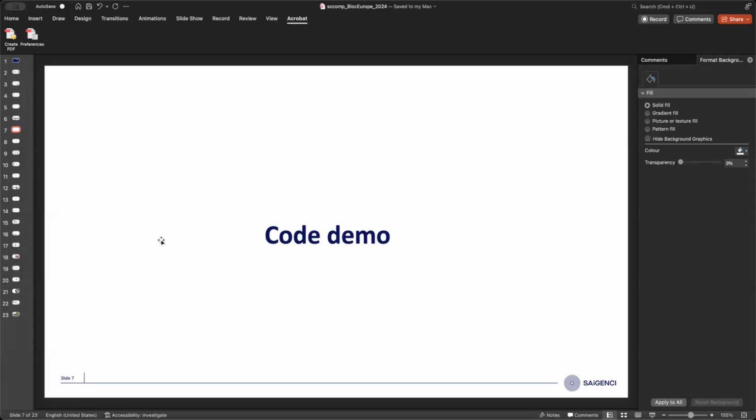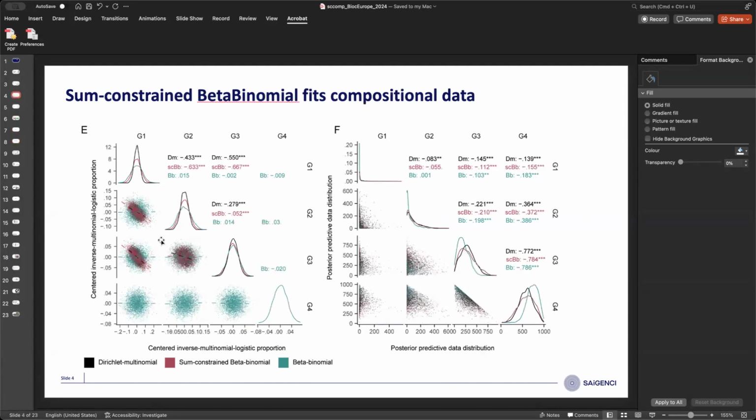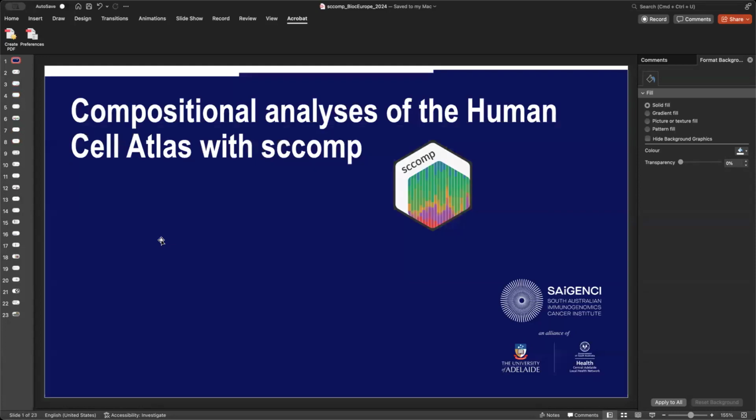I would like to ask about the cell annotation. Is sccomp specifically defined for certain species, or how does the annotation work? No, it's agnostic to annotation. Basically, you have clusters, and you are measuring how their abundance varies in some conditions. In the output you have already annotated some certain cell types. Yes, because when you give sccomp the column of your clusters, that could have arbitrary names. So the names are in your visualization as well. You know what I mean?